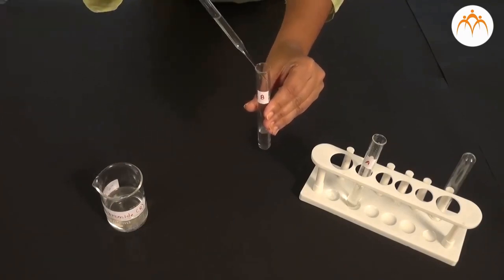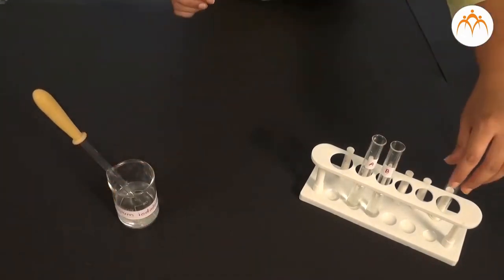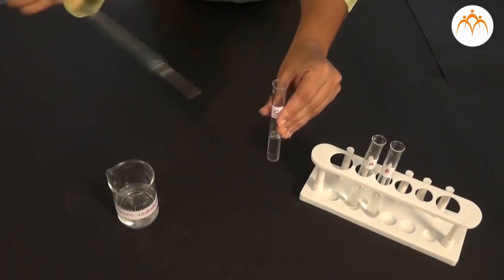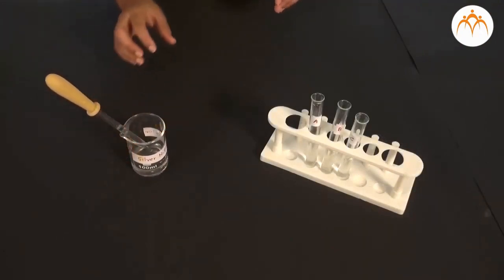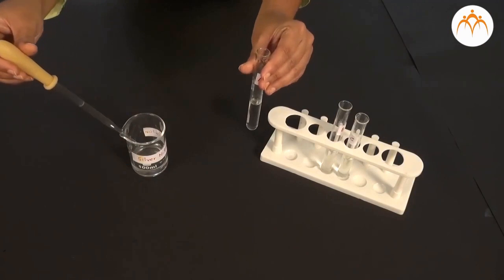Silver nitrate or AgNO3 is a reagent and it reacts with the solutions in the test tubes A, B and C. Then you will observe what happens. We need to be careful while adding silver nitrate. Don't waste silver nitrate, it is a costly reagent. Adding a very few drops is enough for the chemical reaction. Note down the observations in the table.